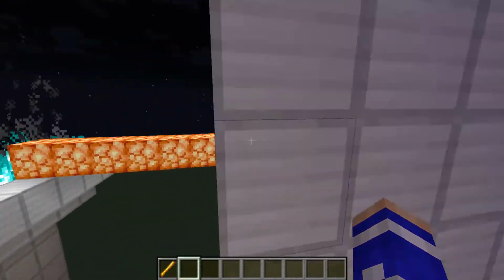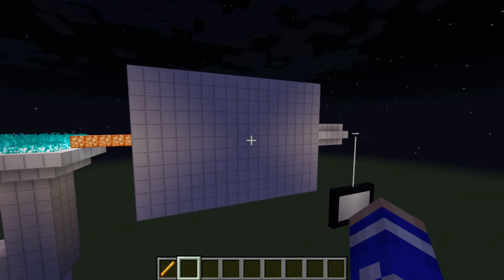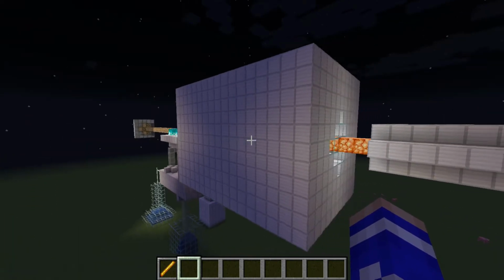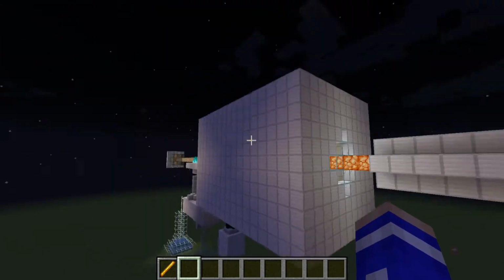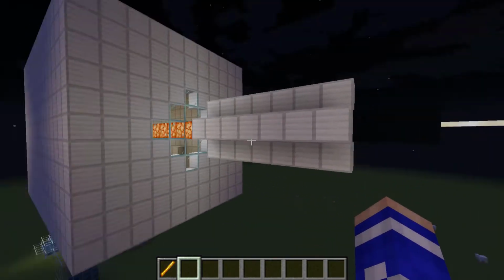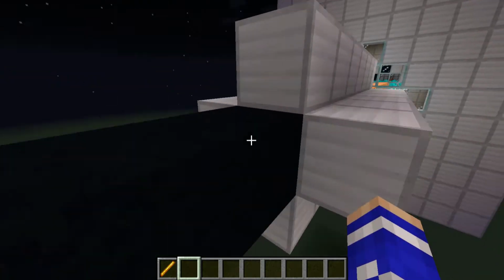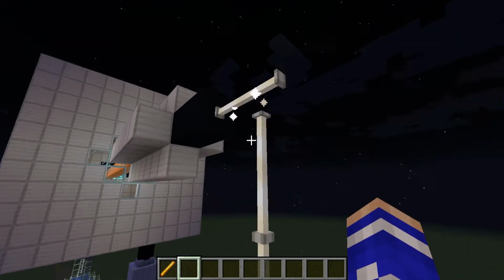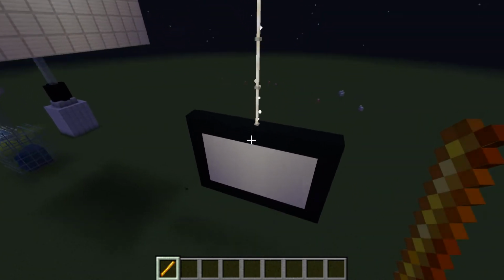The rest of it will travel through into this machine, which is the monochromator. This breaks down the wavelengths so we get the specific ones we want to analyze. After that, that light will travel into a detector, a photomultiplier tube in this case. That detector will change it into electrical signals, which will travel down into our readout here, so a computer screen in our regard.